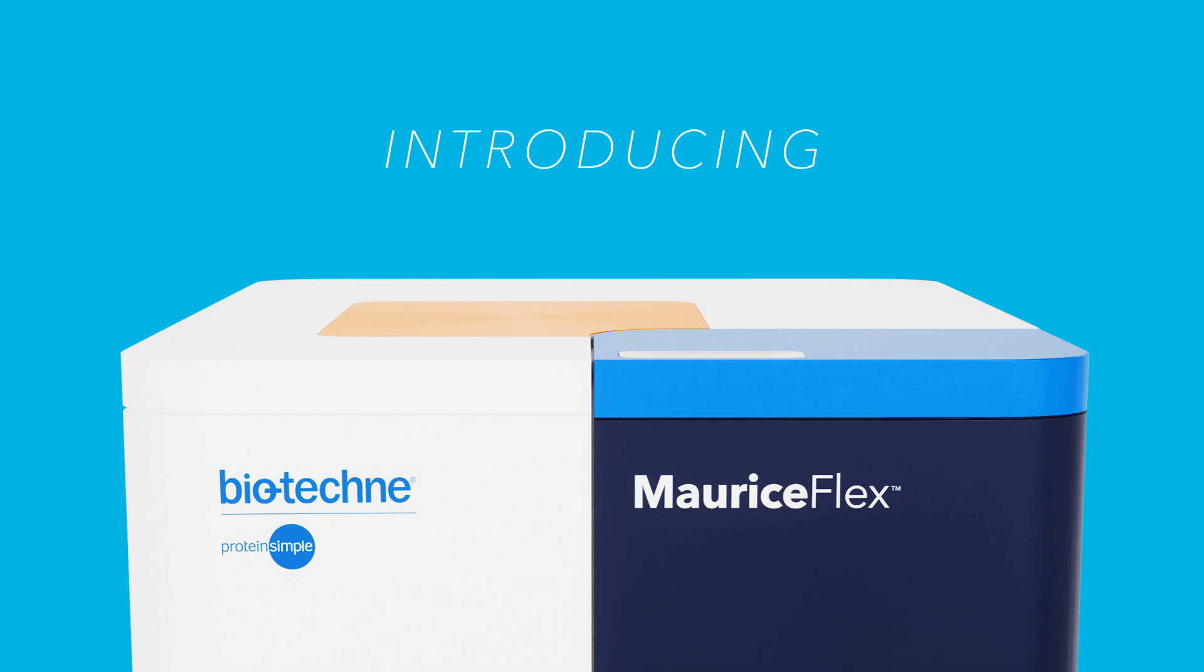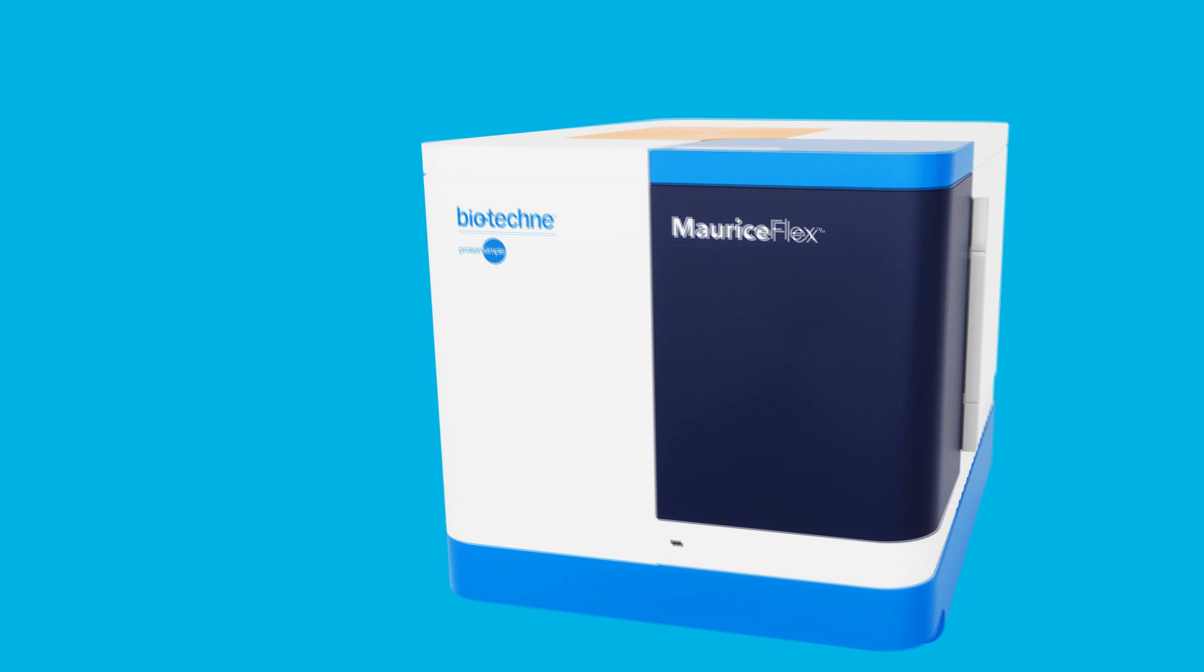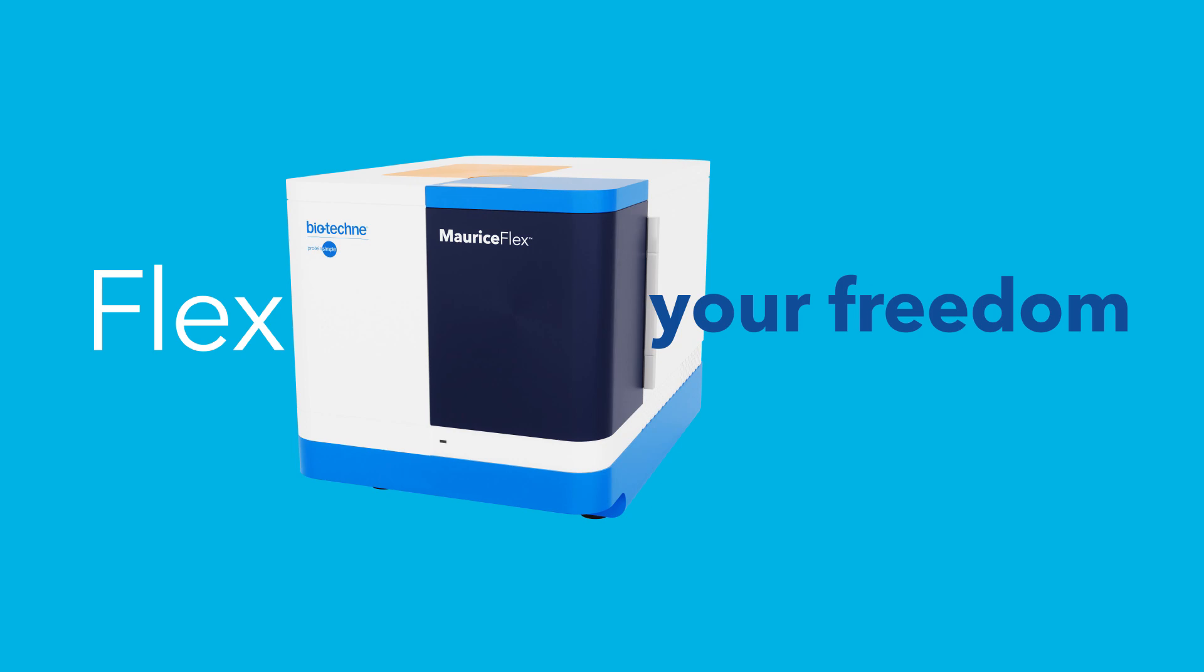Introducing the all-new MauriceFlex, your multifunctional capillary electrophoresis solution that gives you the ultimate in flexibility and freedom for protein characterization.